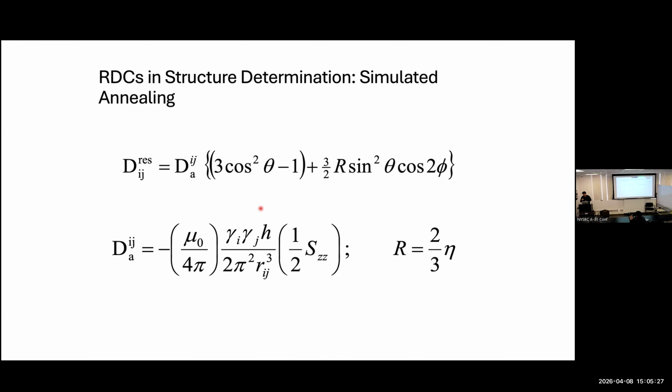Correlation time is not necessarily it. So I have my one vector. Imagine I have one vector up here, and I get 20 hertz. Here I get minus 10 hertz. I do my splitting measurements. Let's imagine the exchange is super slow, for fun, and they have the same chemical shifts. But in one case the value is 20 hertz, in the other case minus 10. What would I see if I measured the splitting? Would I see 10 hertz or 20 hertz, or the average, if it's in super slow exchange?